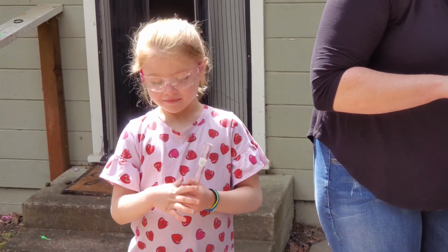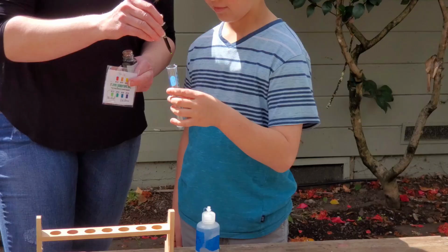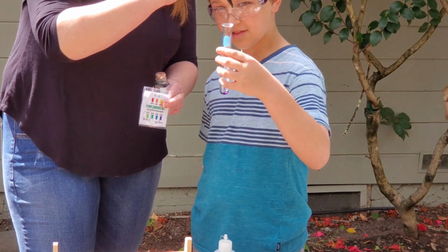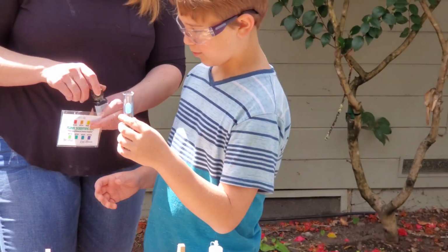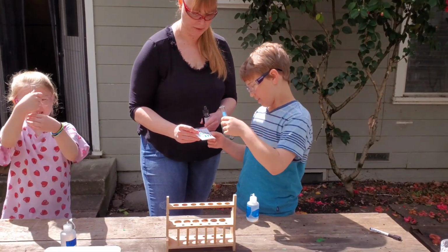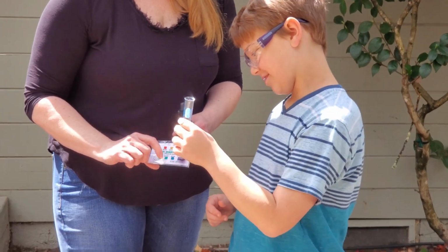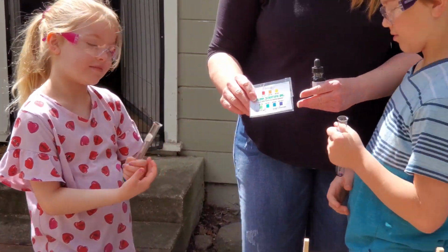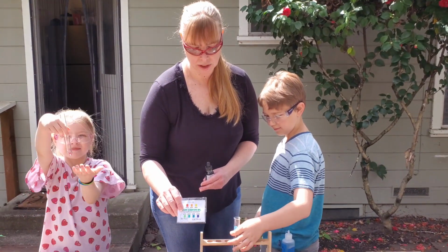Now, let's do Troy's. He's got the ammonia household cleaner, Windex. Purple. Hold on. And what color is his? Put it in the light. Purple. So is that an acid, neutral, or base? This one. A base with pH of 10. Joel, yours was red. That's like a pH of 4. Okay, so what do you think, guys? Is that chemical or physical change?